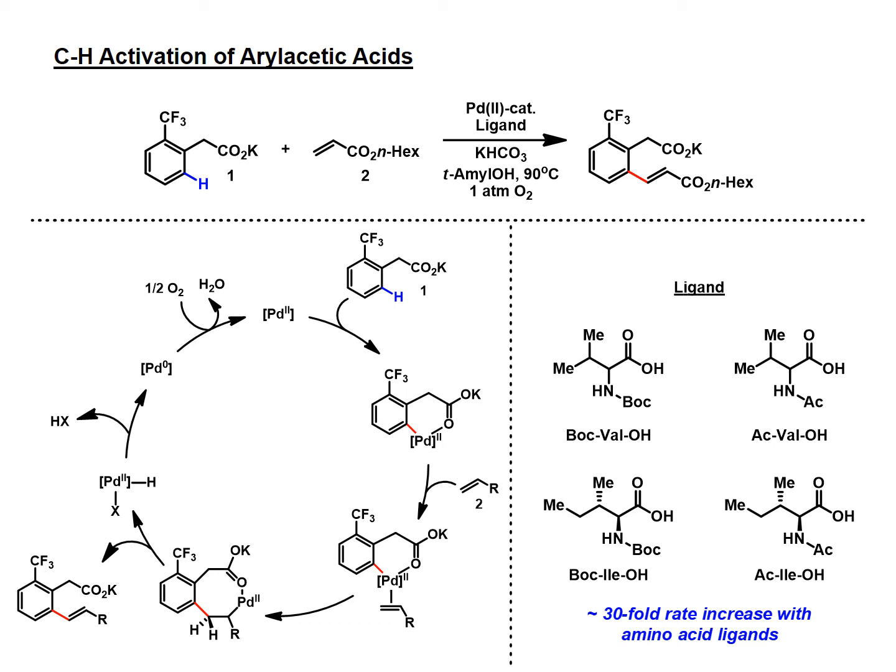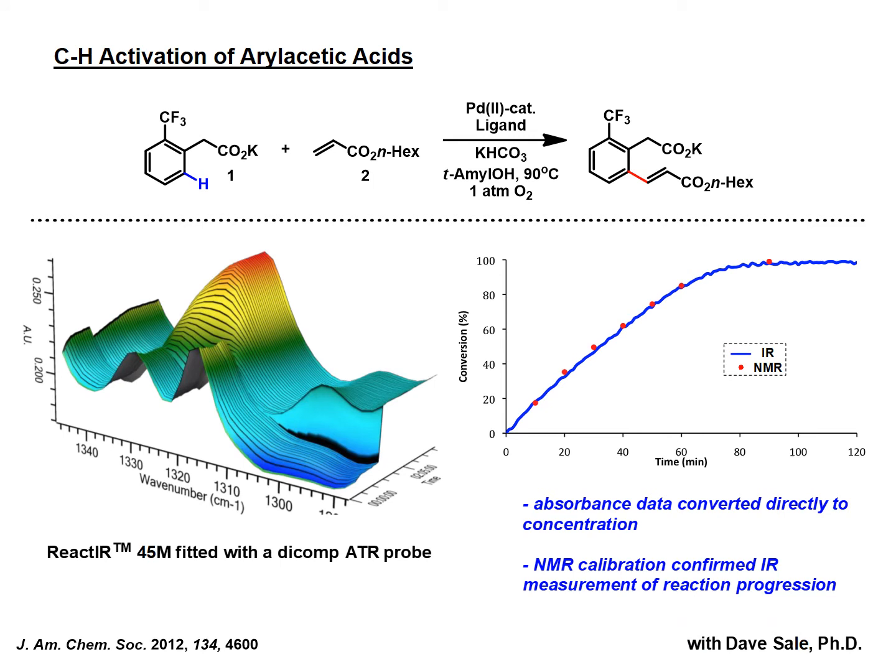That's probably not so surprising. Running something ligandless is not the best way to run a reaction, but they wanted to know, structurally or kinetically, how do they play a role in this reaction? And so we're going to do the same thing. I'm going to get my waterfall plots on my IR.